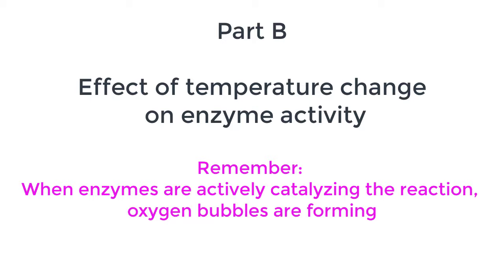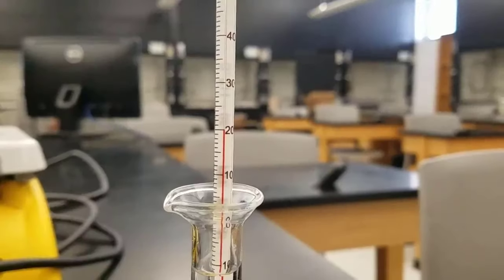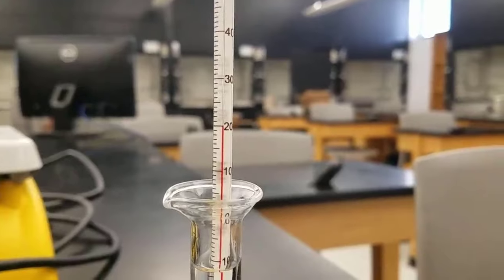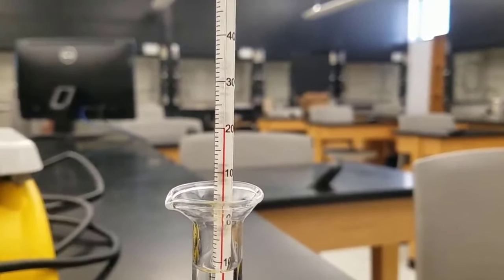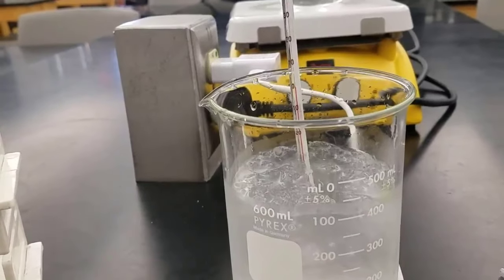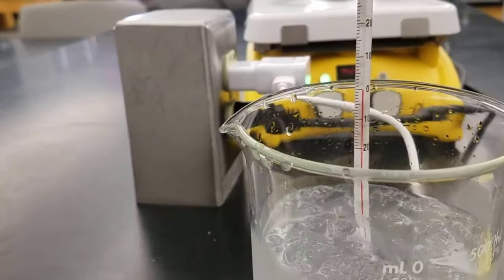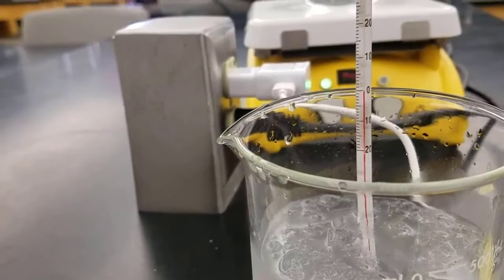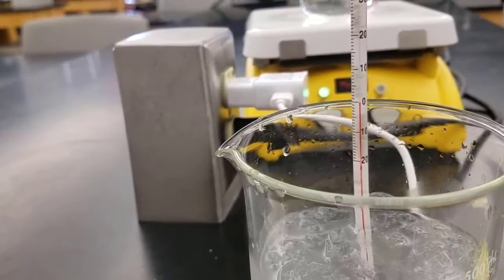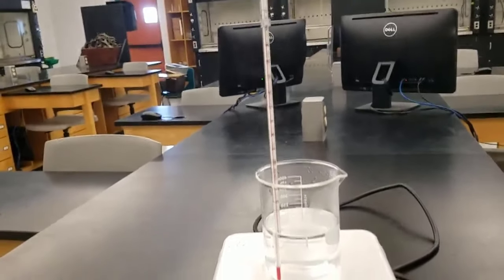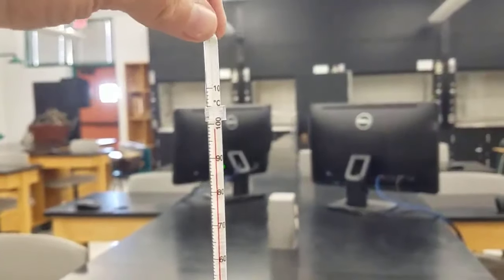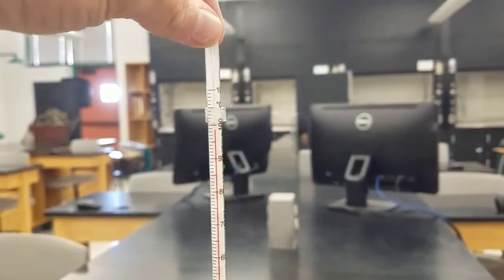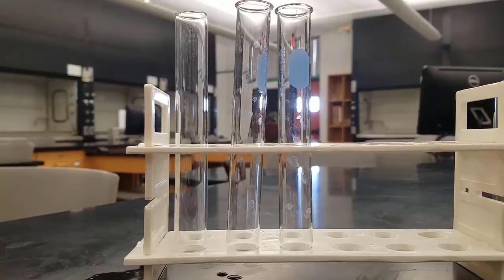For Part B, we're going to look at temperature change on enzyme activity. The enzyme is active if we see bubbles. First, I've got some room temperature water — write down the temperature you measure there. Then I have some ice water, and again write down the temperature you see. Finally, we have some boiling water. So we've got room temperature, freezing, and boiling — three temperatures, three test tubes.